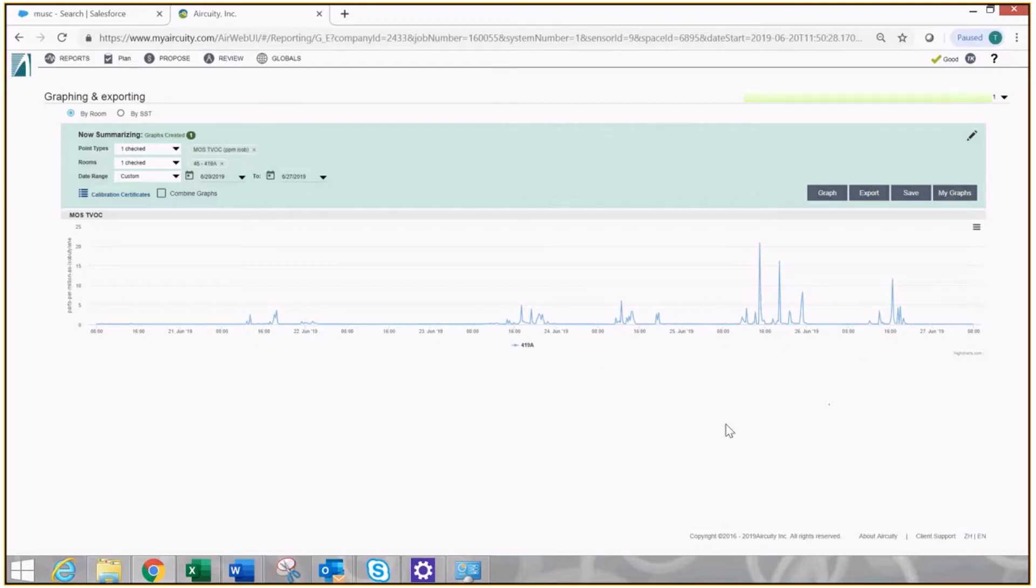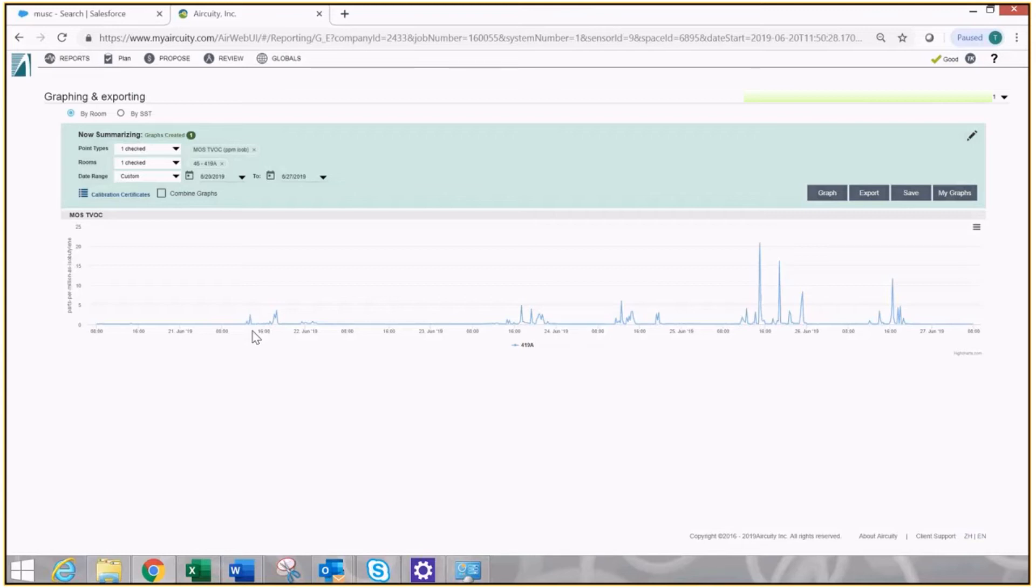Simple fix. I'm going to go to that room at four o'clock, see exactly what is going on. What's the research you're doing? What's happening that's causing these events to get into the air and the space? I'm going to fix the problem at the source, not rely on the dilution ventilation to be the fix.